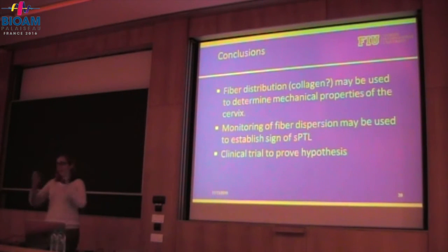So in other words, the cervix does not change in arrangement as you go through the cervix. As a first approach, we thought that just a shallow penetration would give us the best results.